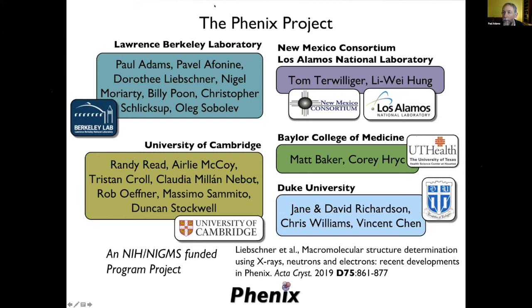There was a question about running X-triage on serial data. I assume that you mean XFEL or serial crystallography data. Yes, you can run X-triage on that kind of data when it's been merged. I'm not sure you'd want to put a massive unmerged serial data set into X-triage. It's not really designed for that. But assuming you've merged the data, then yes, you can of course run X-triage on that, and it's very useful.